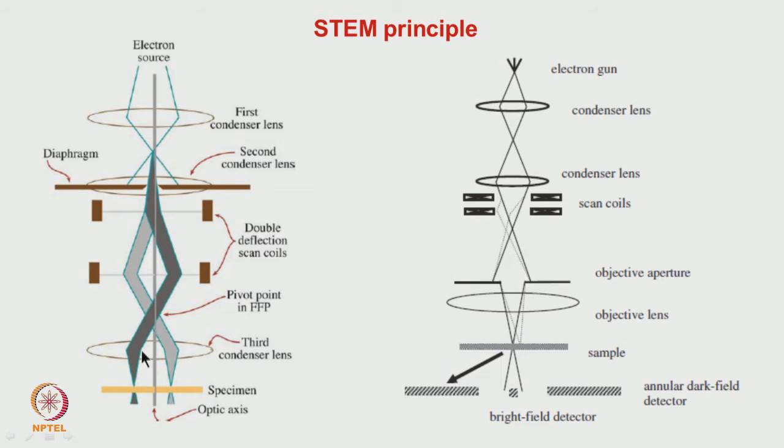In fact, what we should remember is that when this sort of microscope is being used, essentially we are scanning the beam on every region of that sample. And as the beam is being scanned, we can put a detector here, and the size of the detector and the angle of convergence are used in such a way that all the transmitted beam is collected here, and then we can have a detector which is away from it where all the diffracted beams are being collected. So from every point, depending upon the characteristics of the sample, we find that the intensity of the diffracted beam or transmitted beam will be changing. So the data is being collected by this detector which has been put just below this sample.